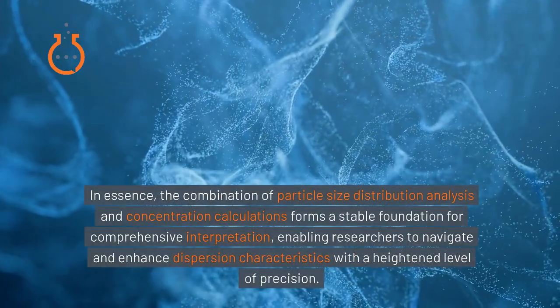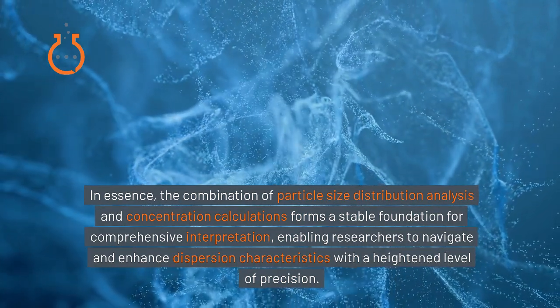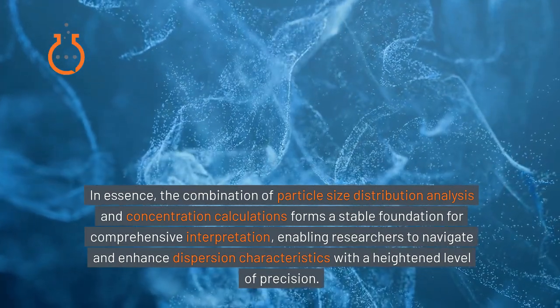In essence, the combination of particle size distribution analysis and concentration calculations forms a stable foundation for comprehensive interpretation, enabling researchers to navigate and enhance dispersion characteristics with a heightened level of precision.